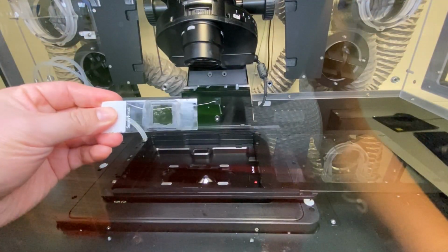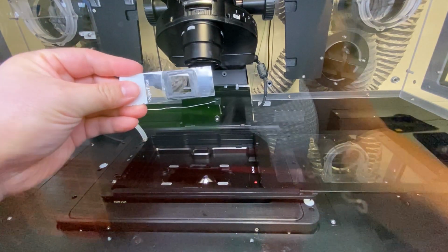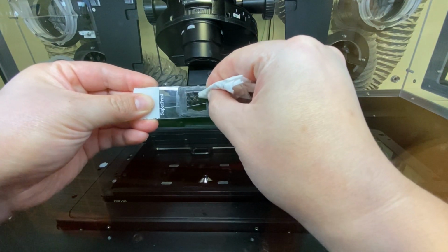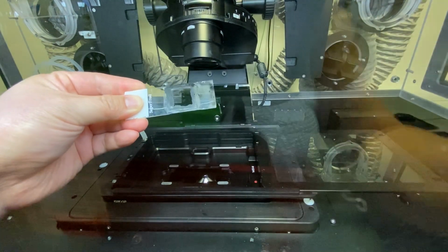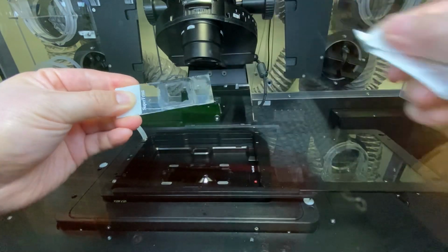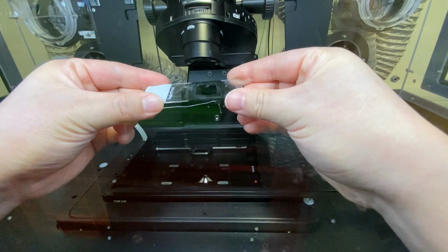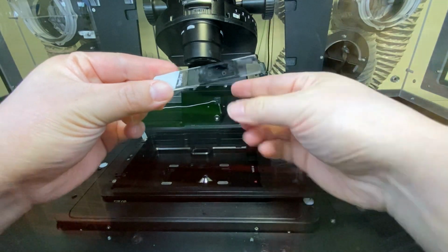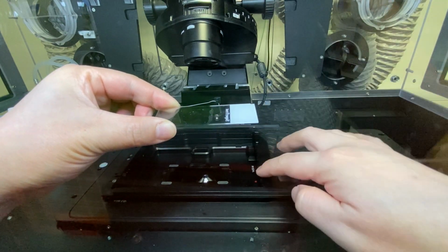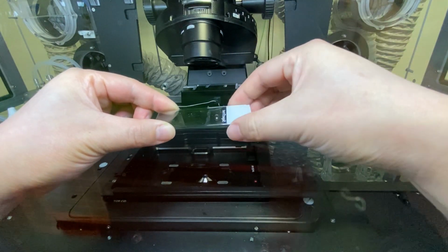So now you're ready to put your sample on. Make sure you know which side your cover slip is on, and if you need to give it a clean, please be careful not to smudge nail polish or mounting media back onto the cover slip. You want to always dry your sample before loading. Whichever side your cover slip is on needs to face the lens. The white writing side, try to put that on the right hand side because there's more room to hold it.